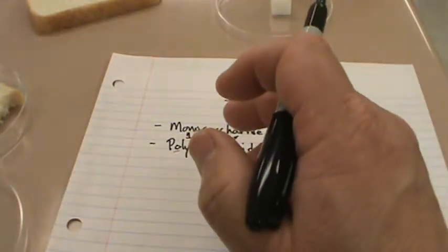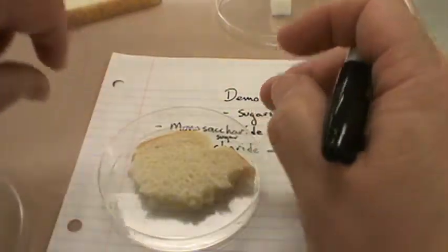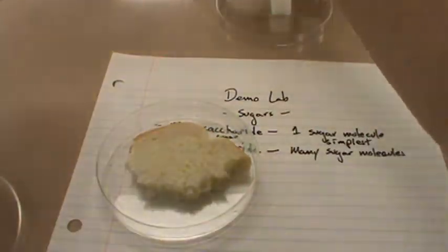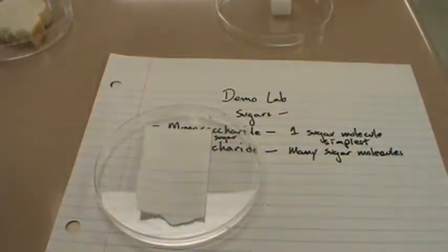But then we combine different forms and we can get bread. Here's the rest of the slice of bread right there. We have bread. We have crackers. Another kind of starchy plant material is called cellulose.